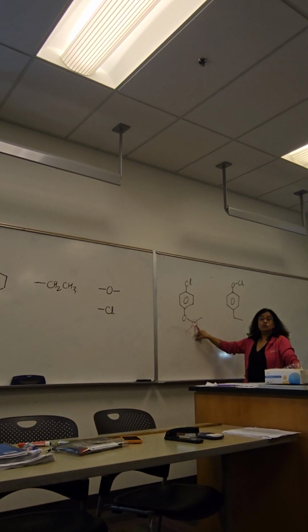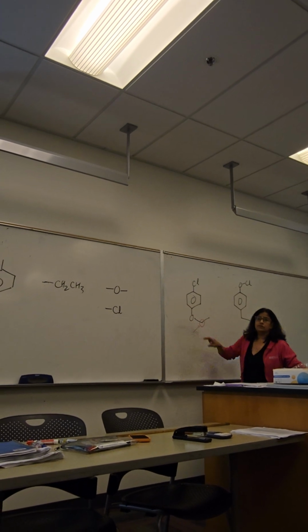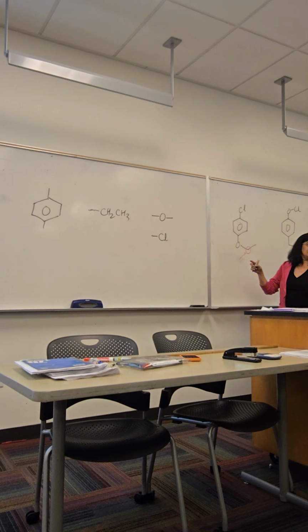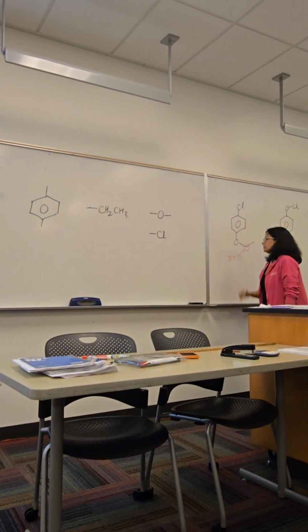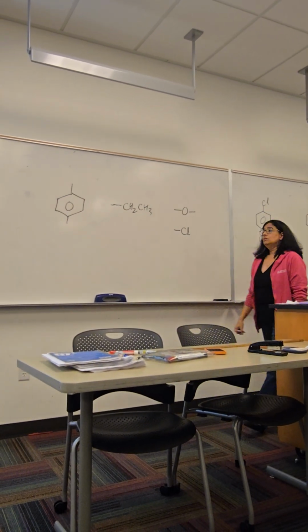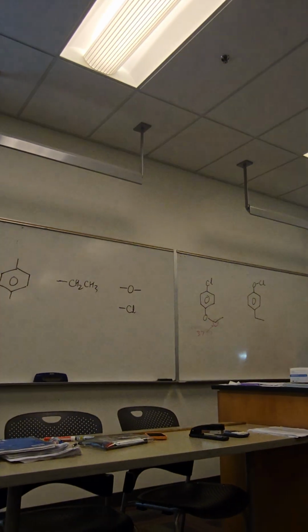Where should I expect those hydrogens to show? It's a CH2 attached to an oxygen, about 3.5 but higher, because methyl versus methylene versus methine, so maybe 3.7 or so, and that's 3. So that's why I'm pausing and I'm like, wait a second, something doesn't make sense here.